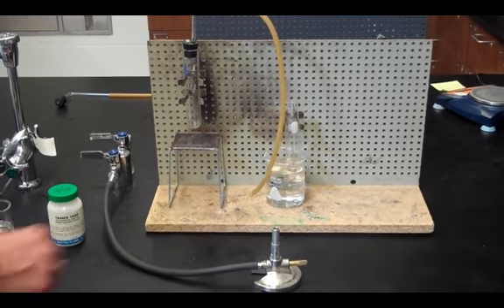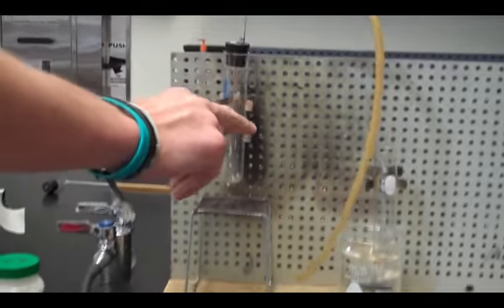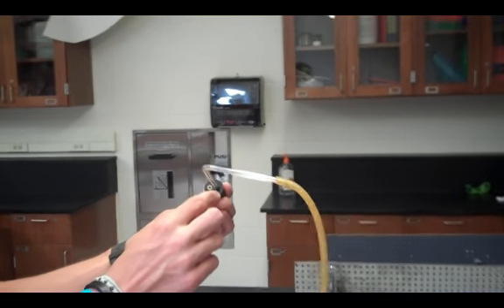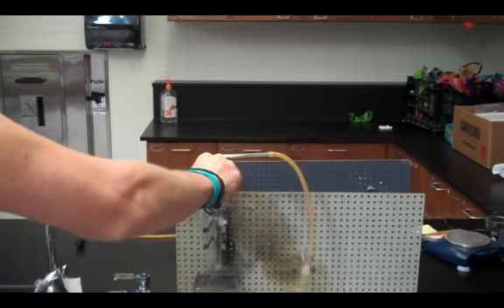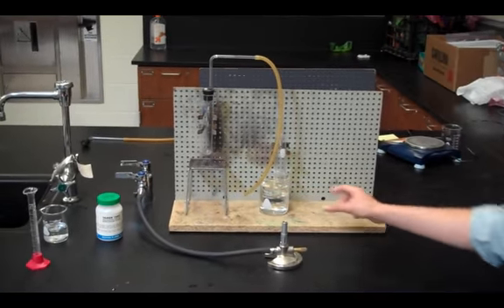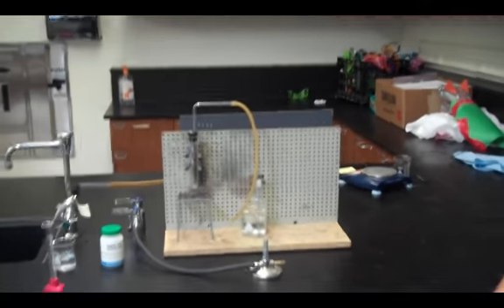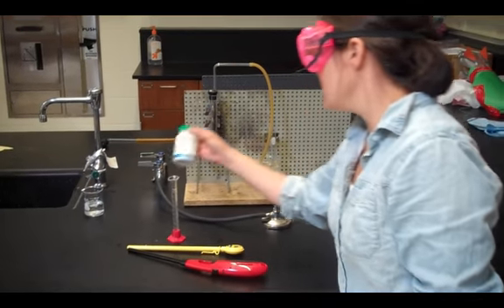Our lab is already set up. We have a large test tube here. This one is secured by two large test tube clamps. This one by one large test tube clamp. And we have our tubing apparatus in a stopper that has a hole for a thermometer and a hole for the bent tube. We've got a burner stand, and a beaker that is mostly full of water that our second large test tube is submerged in. We also are going to need a graduated cylinder, a thermometer, and some boiling chips.